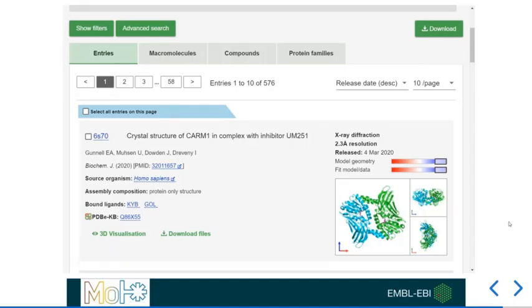Okay, so if there's any other questions, keep writing them into the chat box. So there's a question about volumetric data and showing protein cavities. Is it possible to display it as a density map? Interesting. I'm not familiar with what that type of data file would be. If it takes the shape of a typical map format file, then perhaps, yes.